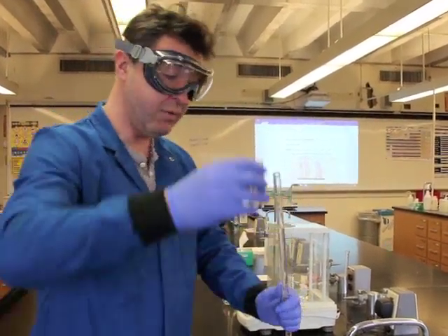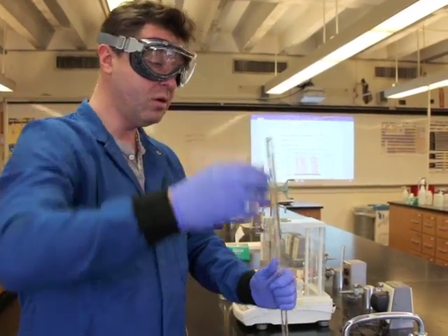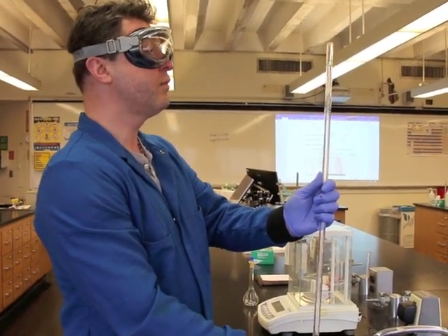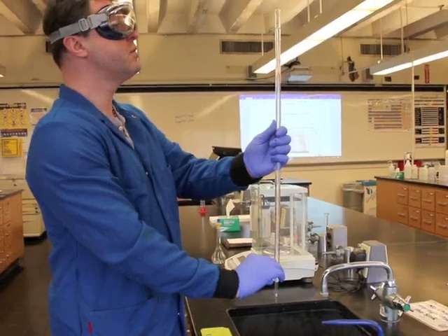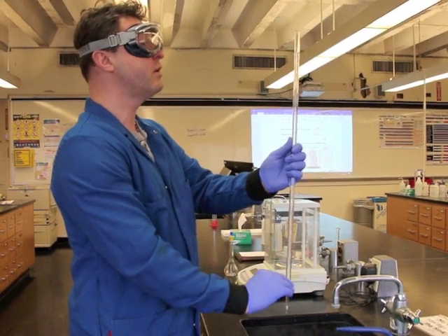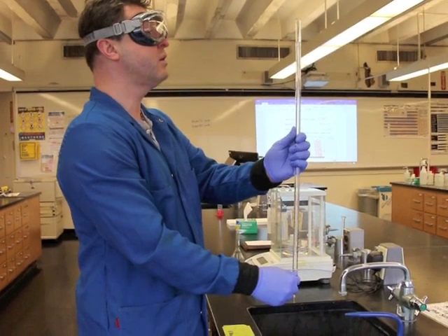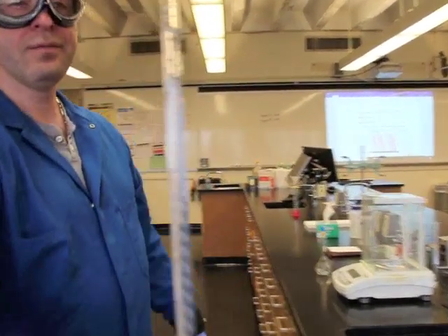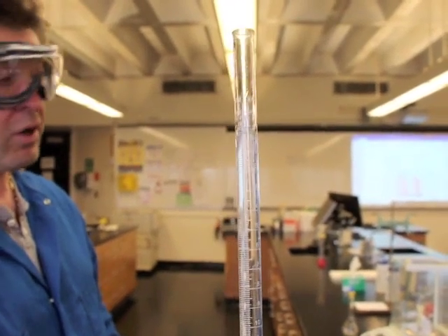Before I start delivering volumes with the titrant, I want to adjust my volume to zero. I rotate and open the valve, making sure the bottom of my meniscus is touching the zero line. It takes a little practice, but there it is - the bottom of the meniscus is touching the zero line. I'm ready to go.